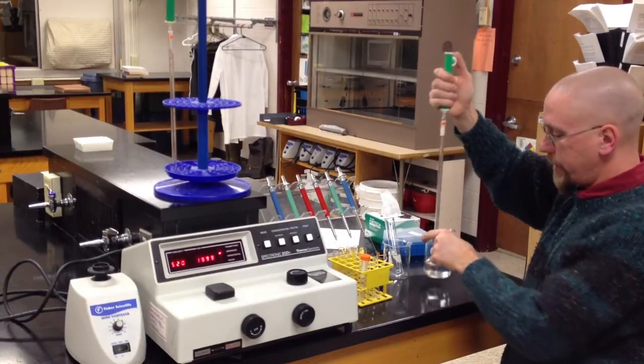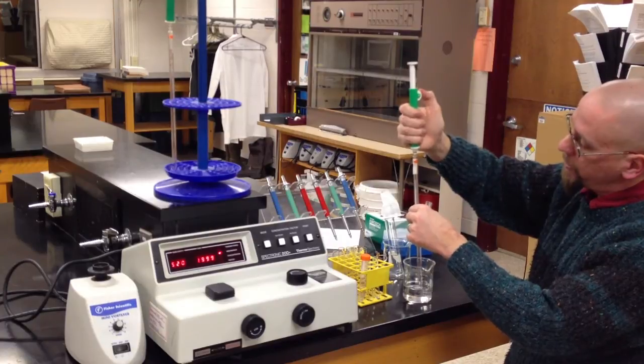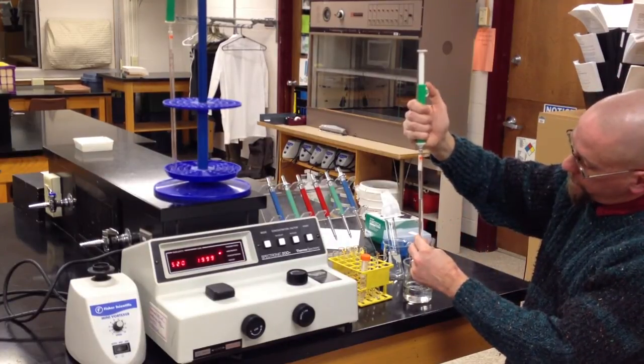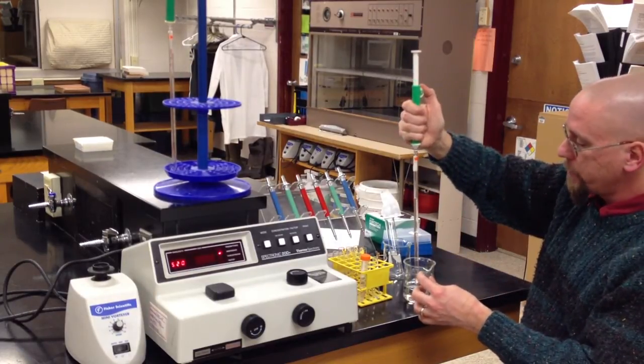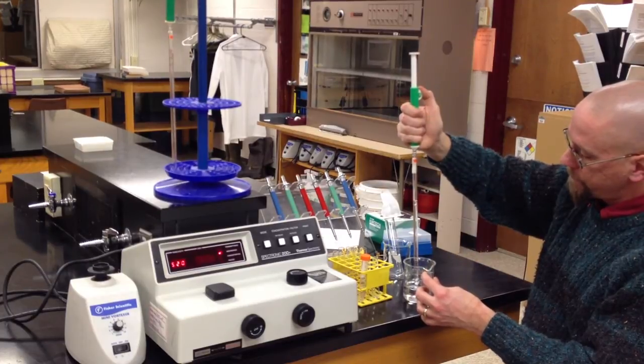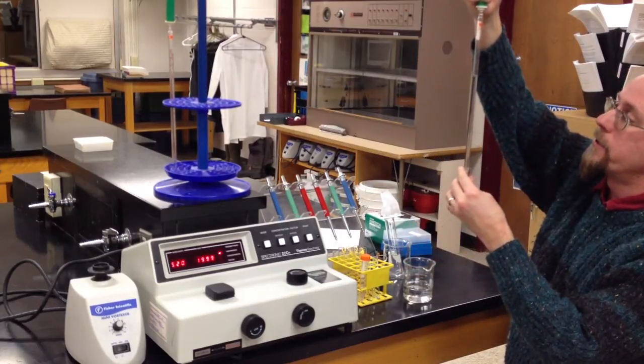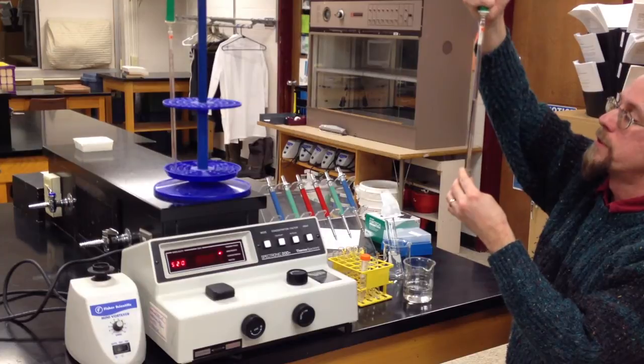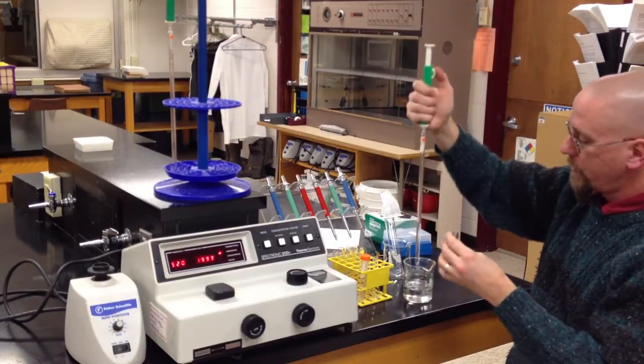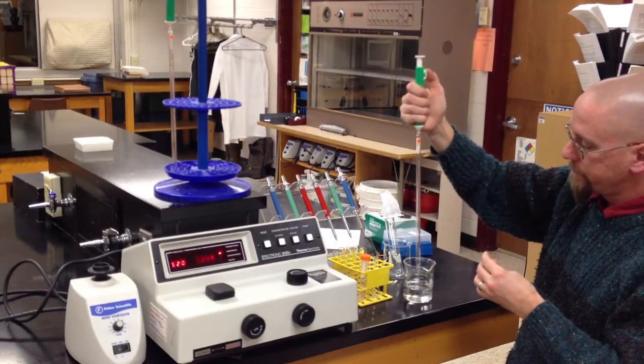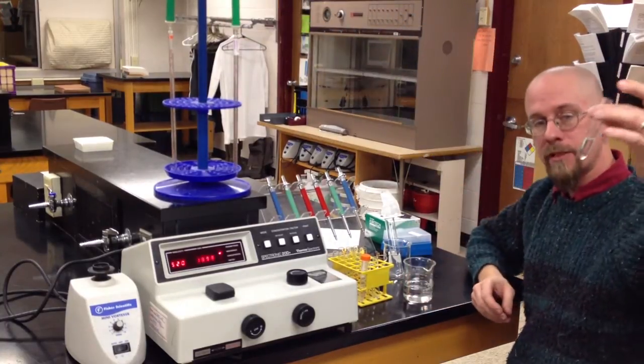So what I'm going to do here is I have a beaker of deionized water. I'm going to use the thumb wheel on the pump, draw up a full 10 milliliters of deionized water, so it's up to the zero. And I will know that I'm accurate when I come over and I deliver down to one, two, three, four, five. Put the rest back. Set my pipette in the rack. Now I have five milliliters of deionized water.